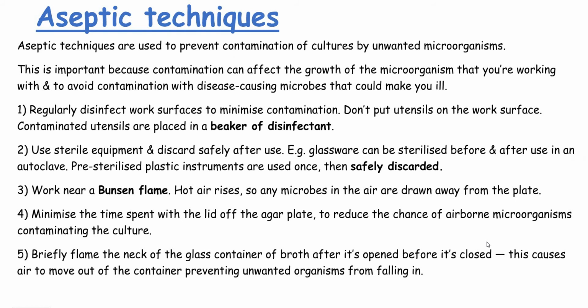Aseptic techniques. So aseptic techniques are used to prevent contamination of cultures by unwanted microorganisms. This is important because contamination can affect the growth of the microorganism that you're working with, and to avoid contamination with disease-causing microbes that could make you ill. You should regularly disinfect the work surfaces to minimise contamination. Don't put utensils on the work surface. Contaminated utensils are placed in a beaker of disinfectant. Use sterile equipment and discard safely after use.